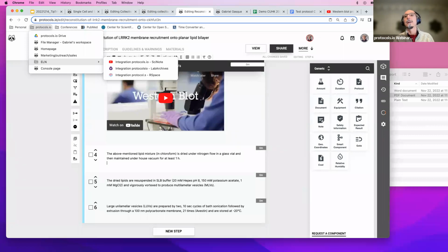There is another question from Gloria, whether there is a difference between forking and versioning. Yes, there is a difference between a fork and a version. Versions are usually done by the same set of authors.